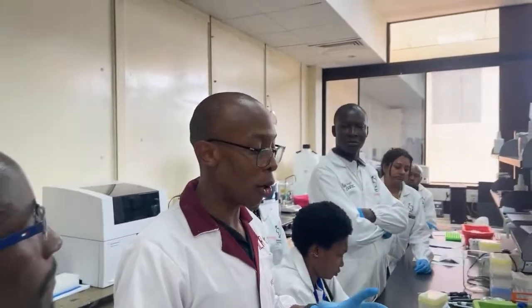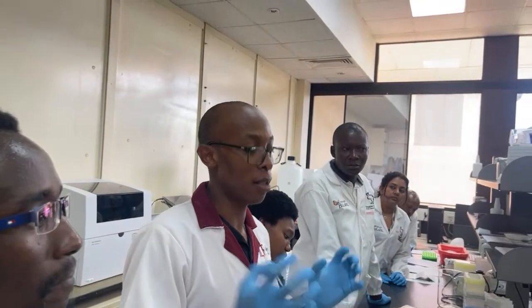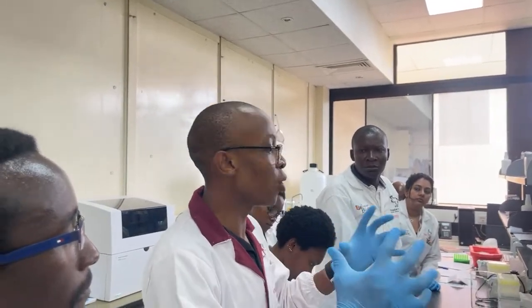So maybe I can ask a question. For conventional, standard extraction kits, normally we keep discarding the supernatant all through. The DNA is held in the columns, in the silica columns. So what makes it different from these high molecular weight DNAs where we work with the supernatant? Is it because we don't have the columns to bind the DNA? So usually the columns have certain binding capacity. They cannot bind the entire genomic DNA from a cell. This is why now with Nanobind or any other high molecular weight method, we just try and treat the DNA as it is from the cells.